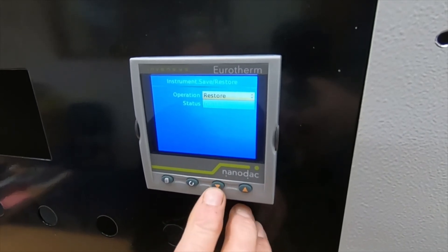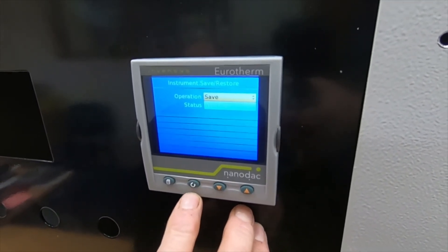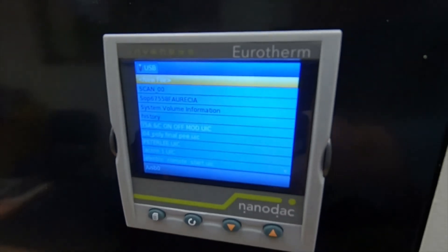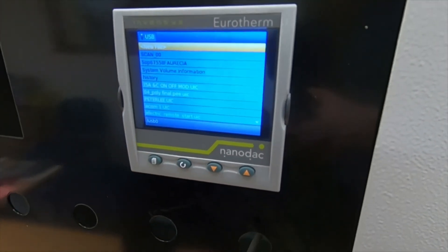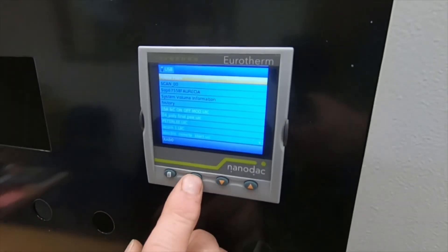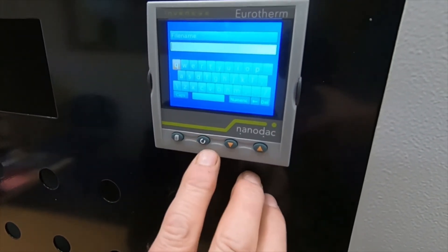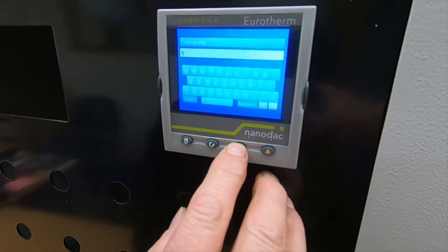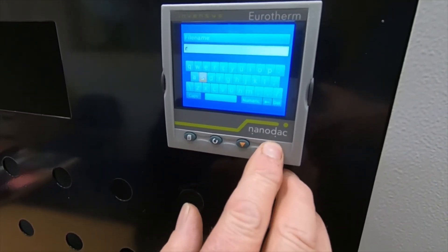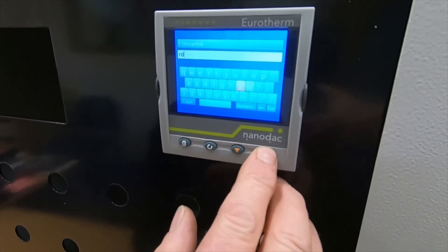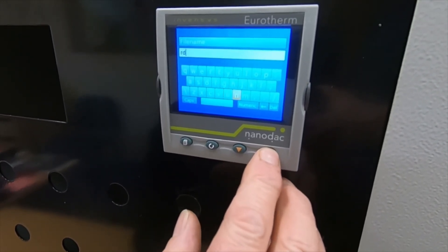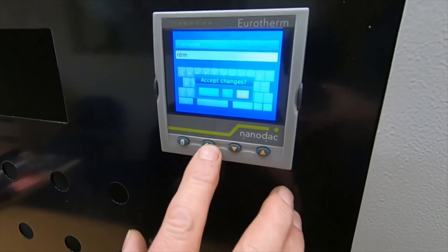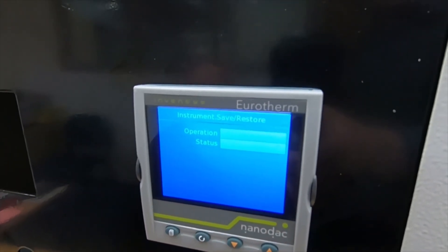Press your scroll button to select save, then press it again. You can see a little spinning indicator — that tells you it's now saving. You then give it a name. We've got a new file, so let's put RDM in. Once you've done that, press the page button again, accept the change, press the scroll button, and you can see it's now saving that program to the USB.